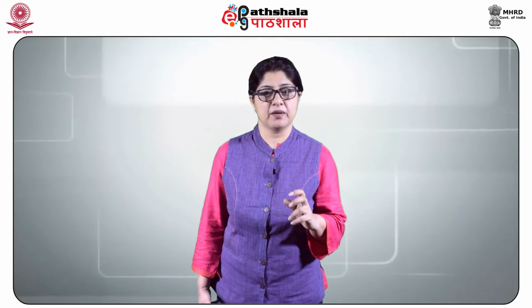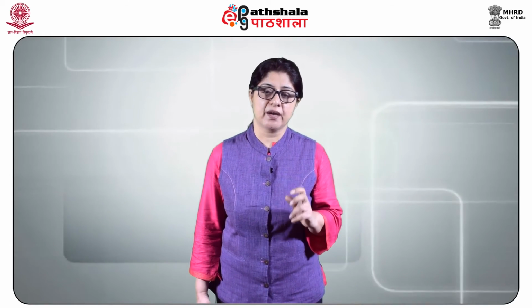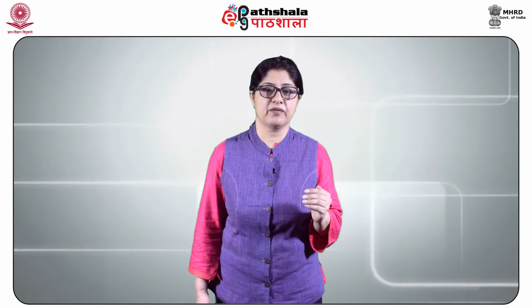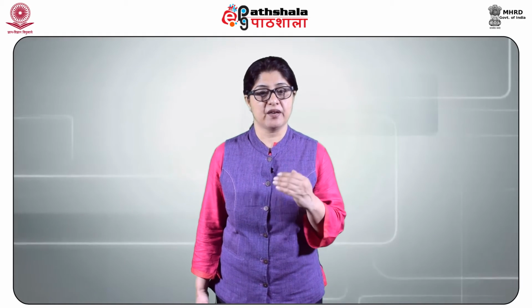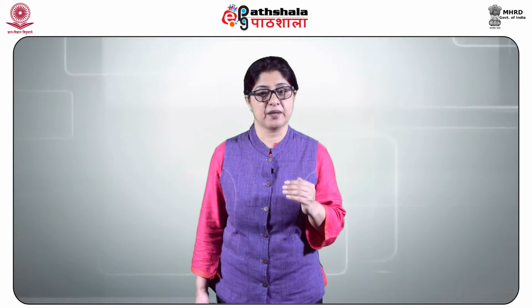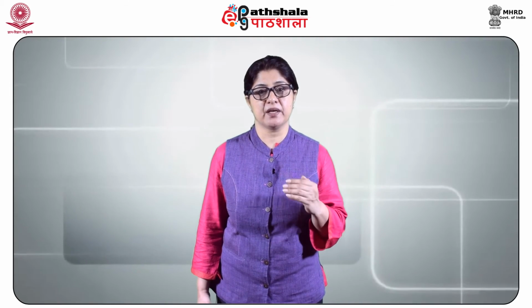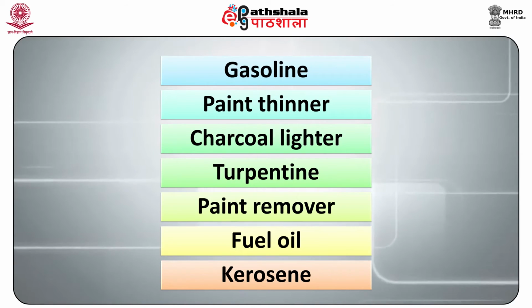Flammables are the number one tools of the arsonist. Fortunately, evidence of their use is not completely destroyed, even for flammable material of high vapor pressure or when the environment has been elevated in temperature for several hours. Types of materials to be expected include gasoline, paint thinner, charcoal lighter, turpentine and many more.